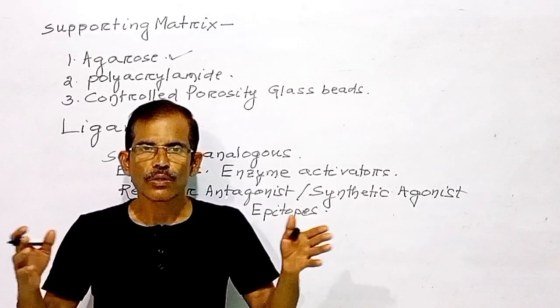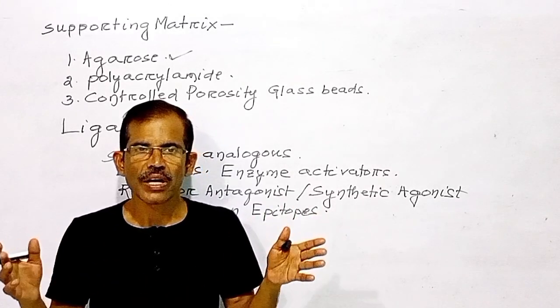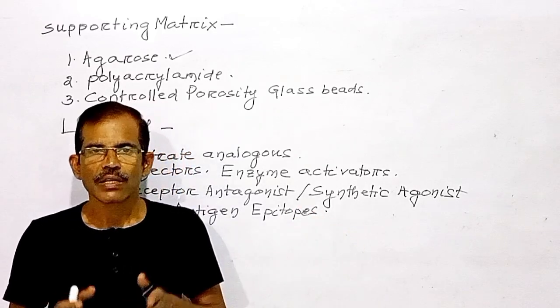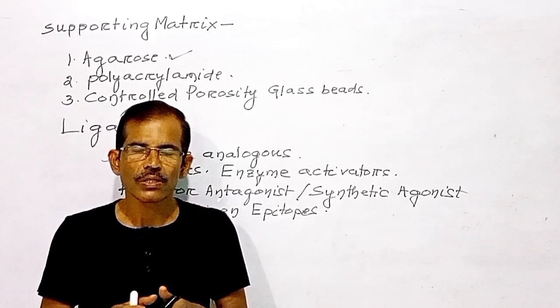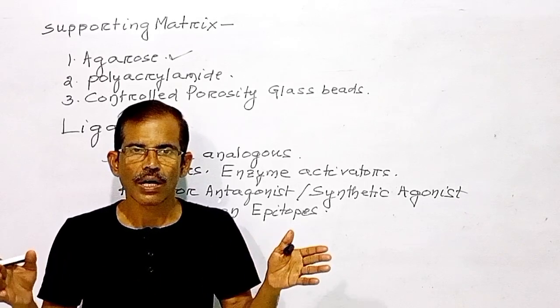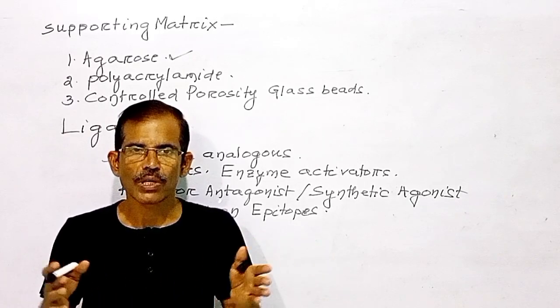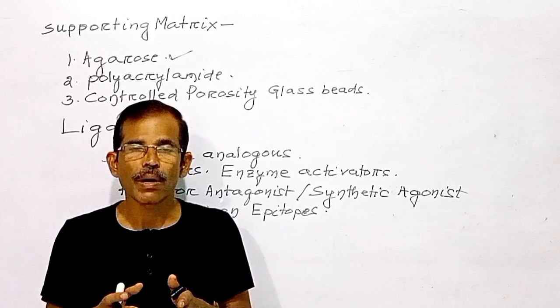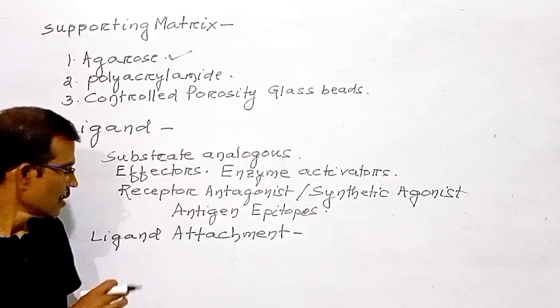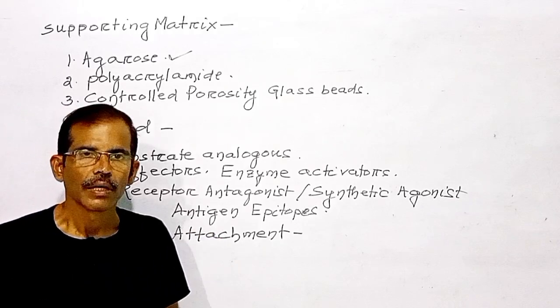It is not usual to utilize substrates as ligands in affinity chromatography, but when it is the only choice available, the conditions are adjusted so that the enzyme substrate complex is formed but the reaction does not take place.